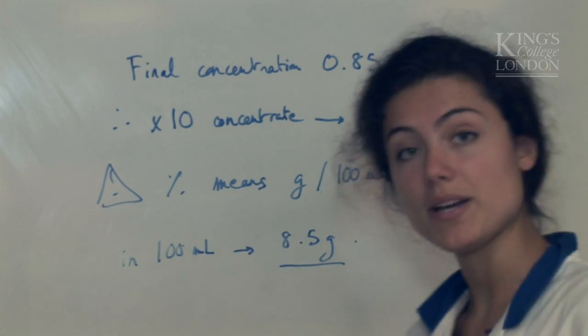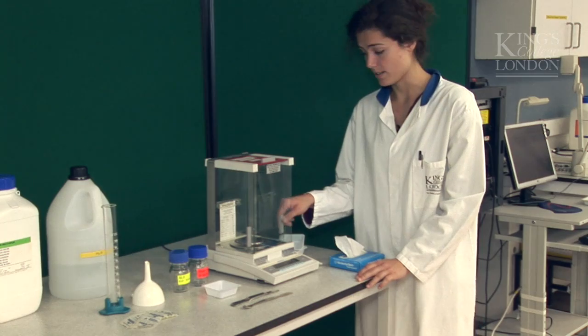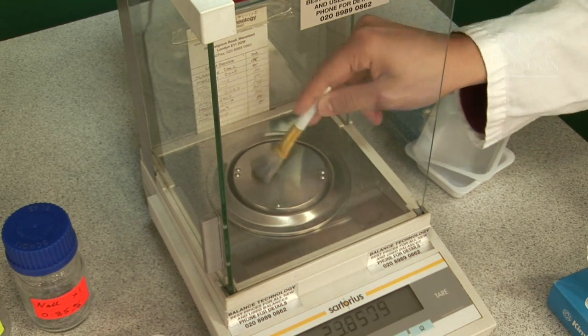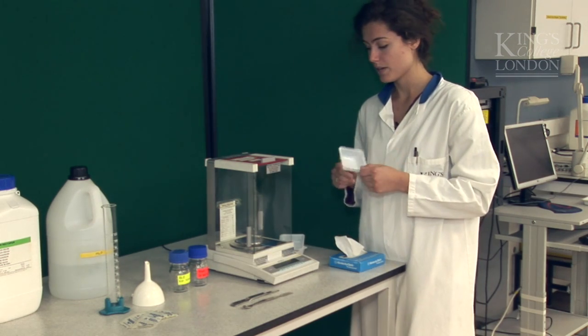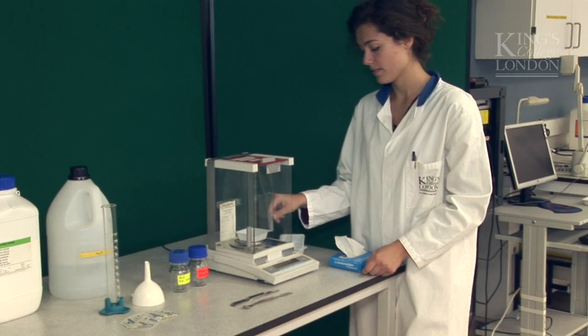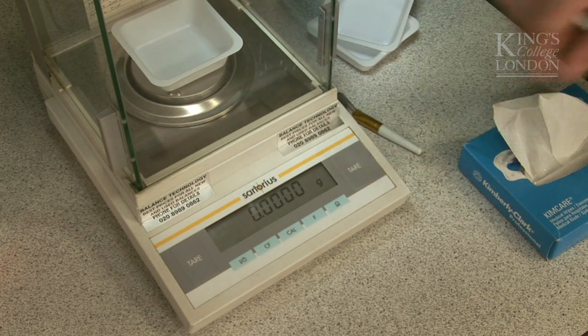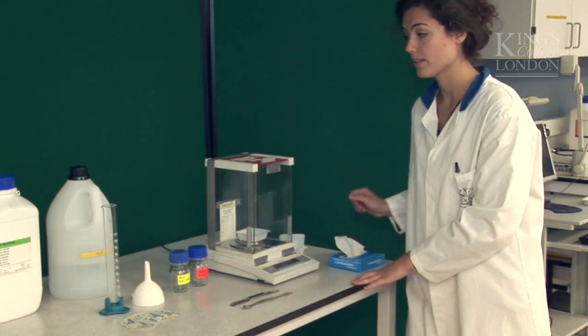So let's go and weigh it now. I need to turn on my balance, check it's clean, give it a little brush. Then put the empty weighing boat inside and cancel its weight by pressing the tare button. And then we can weigh our sodium chloride.